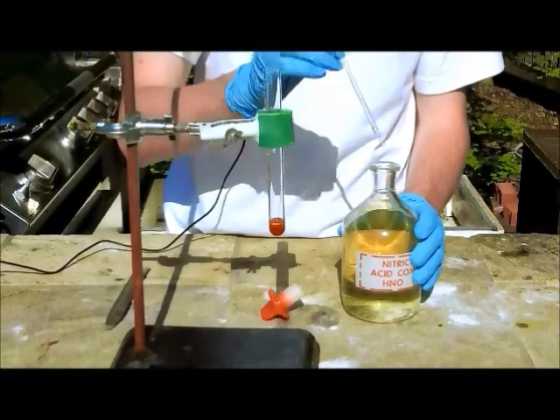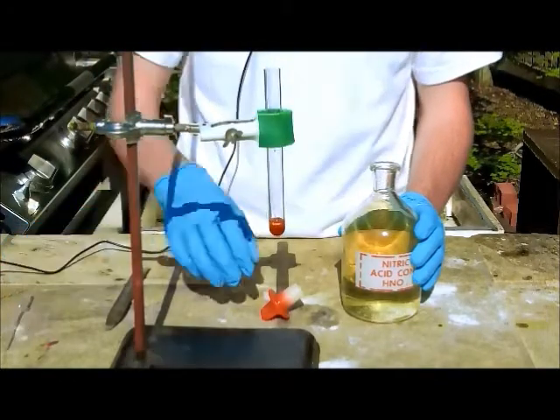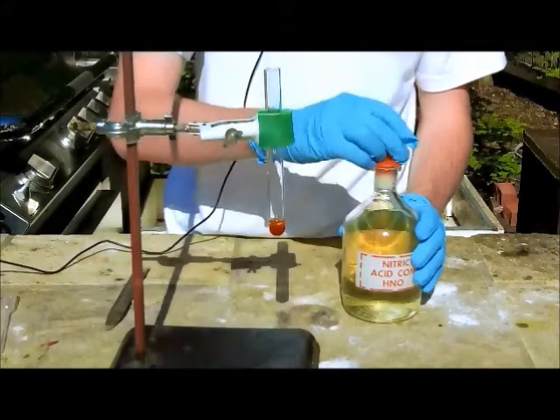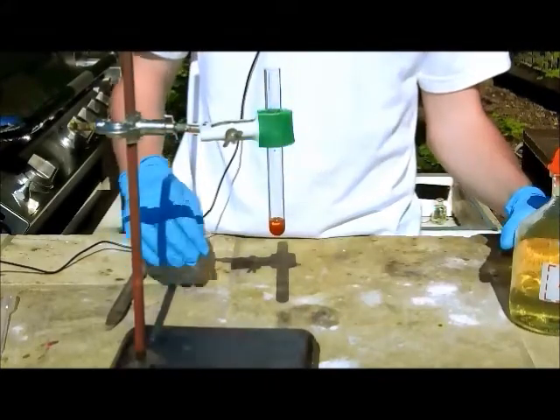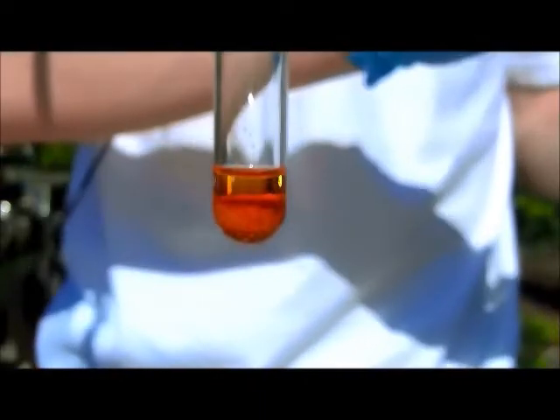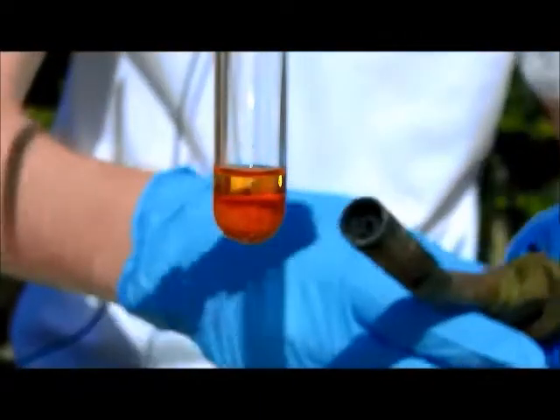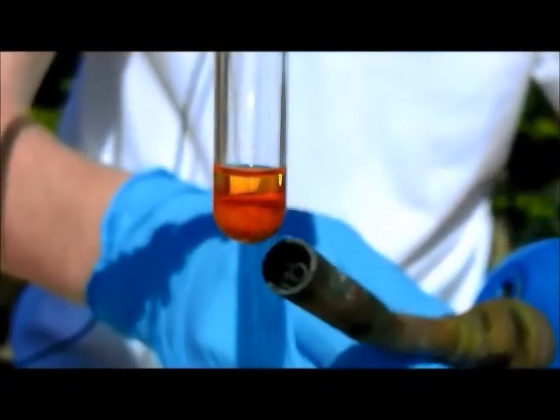Alright, once you've got the crystal slightly submerged in concentrated acid, heat it very gently with a torch. Let's go in for a close-up for this. Okay, now I'm gently heating this with a torch to get all of the dichromate to dissolve.